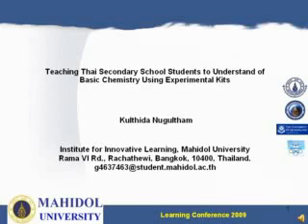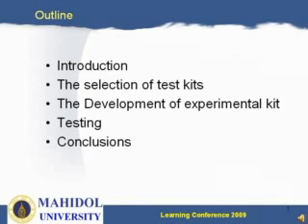I am Kulthida Nugultham. Today I am going to talk about my work under the topic Teaching Thai secondary school students to understand basic chemistry using experimental kits. Okay, let's move to my presentation. The outline is: introduction, selection of test kits, development of experimental kits, and testing and conclusions.